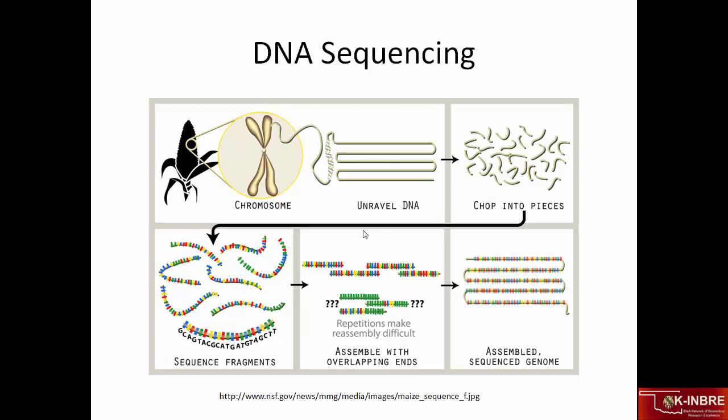DNA sequencing is a procedure that aims to identify the exact order of every nucleotide on a strand of DNA. Currently, Sanger sequencing technology can only identify base pair fragments that span between 800 and 1,000 base pairs, which works fine for the purposes of DNA barcoding. Each fragment is then assembled into a larger contiguous string of characters until the complete chromosome has been sequenced.